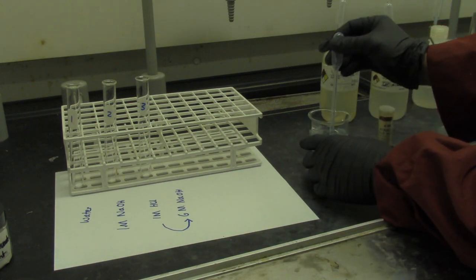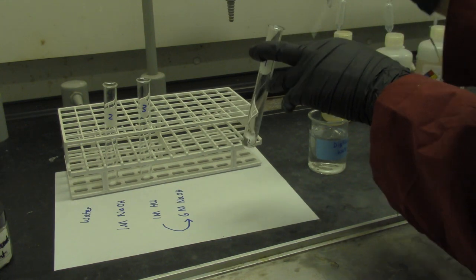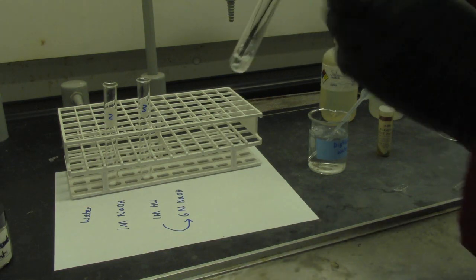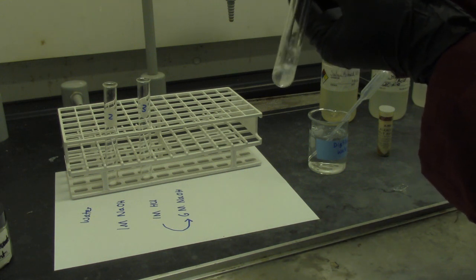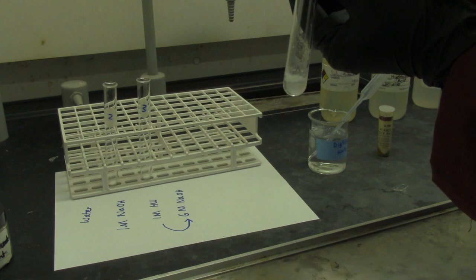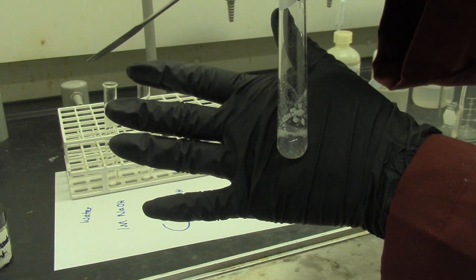To the first test tube, I add 1 ml of water and stir for 20 to 30 seconds. Take down the observation.